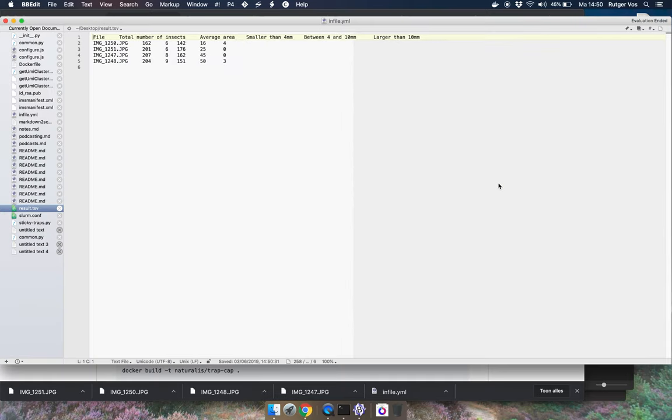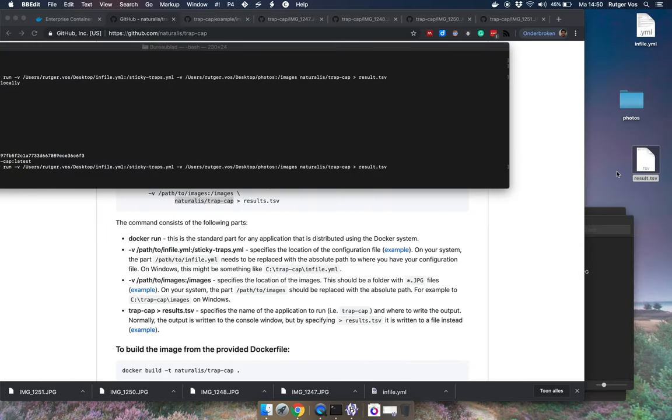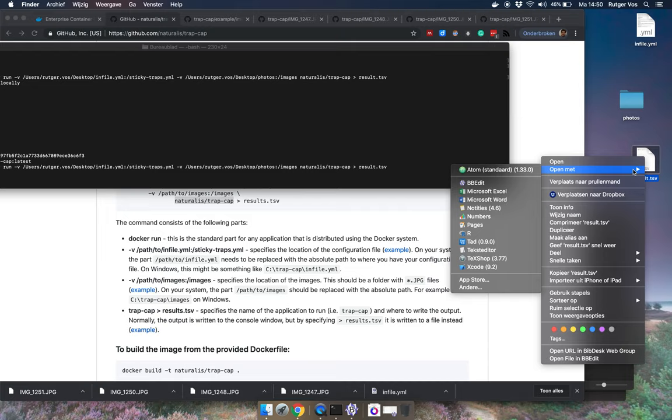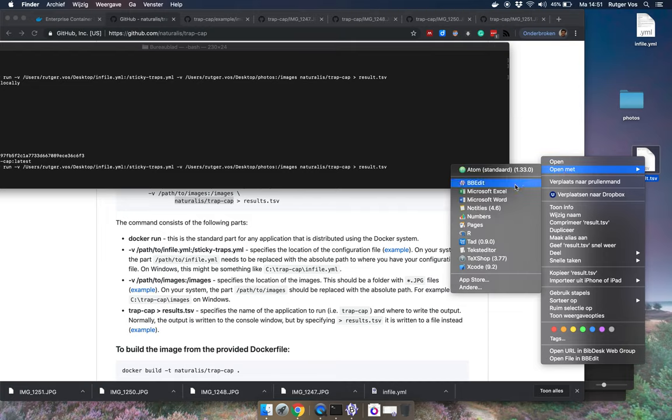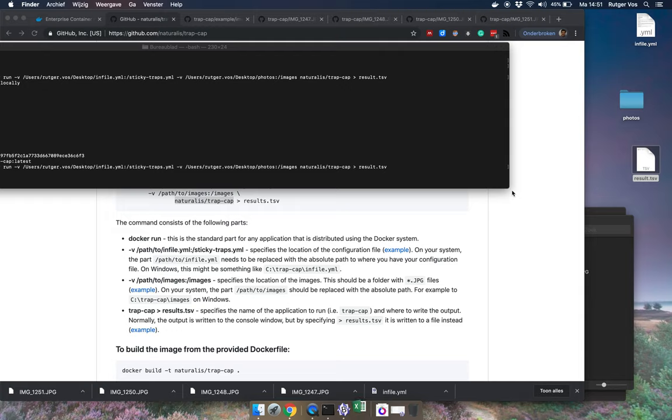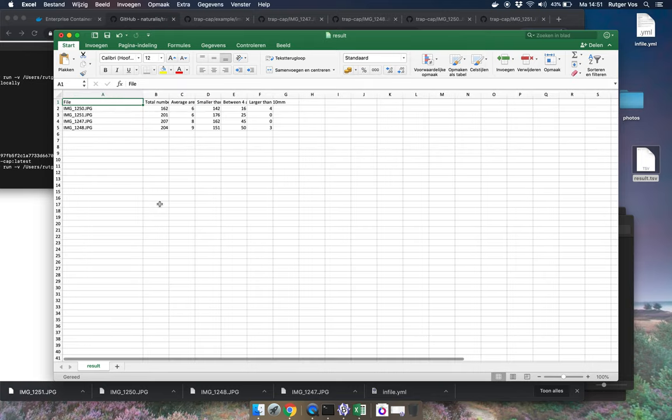And if I open that in my text editor again you can see that this is tab separated data. And so I can also open this in something like R or for example here in Excel. And you can see that it reads it in as a table.